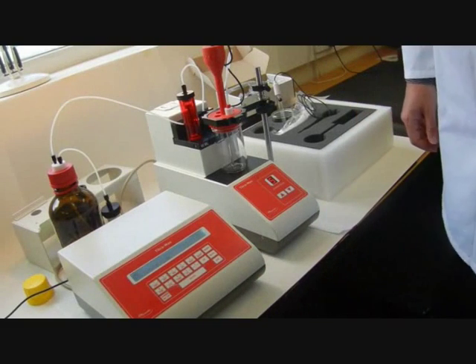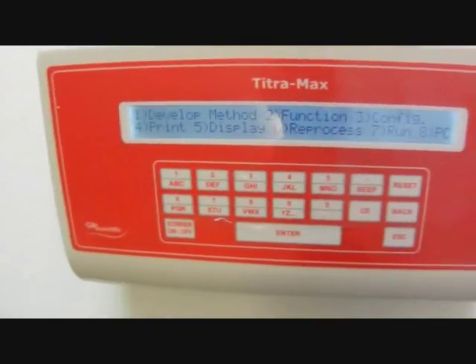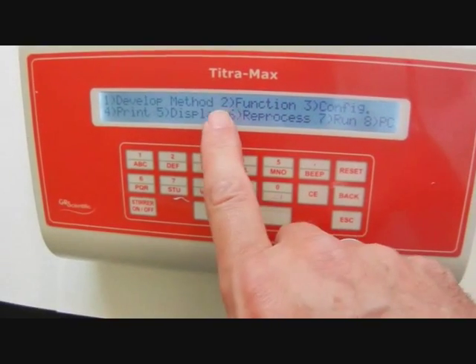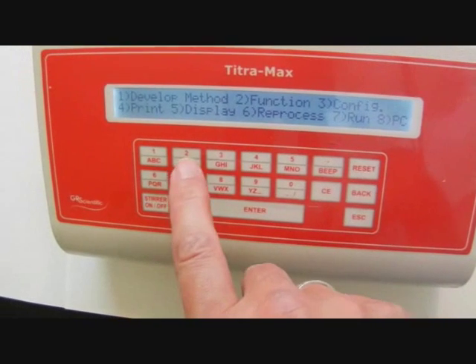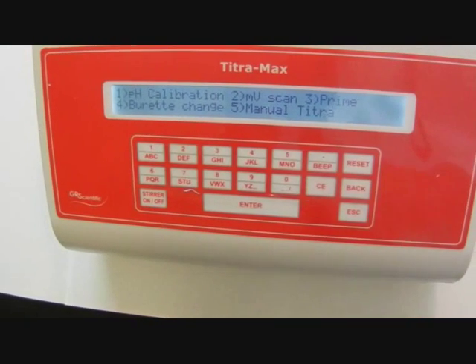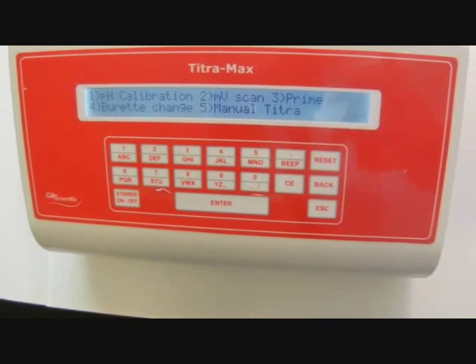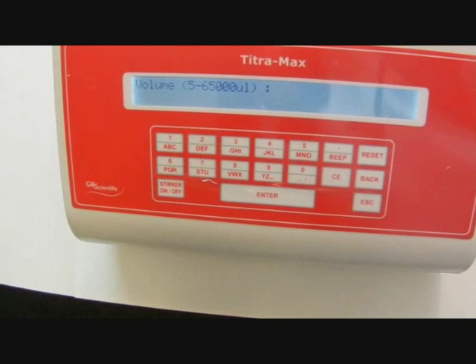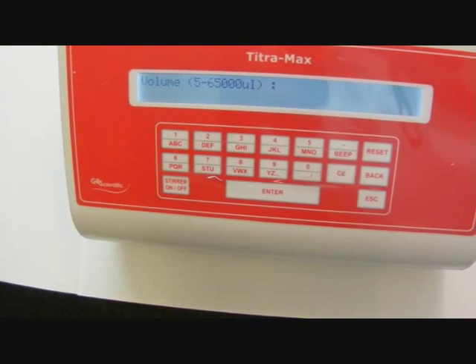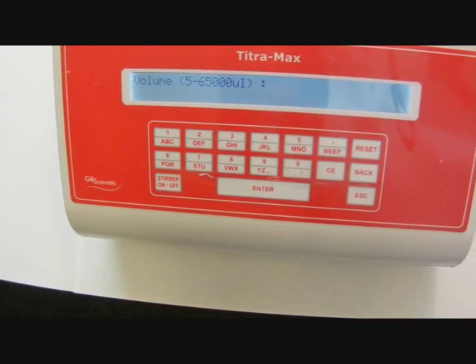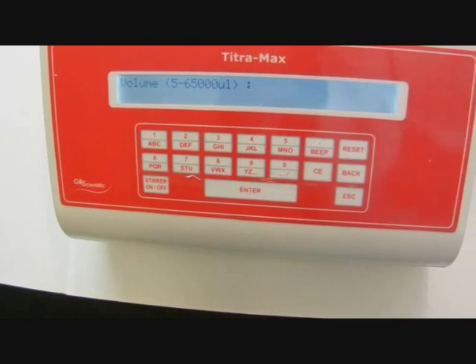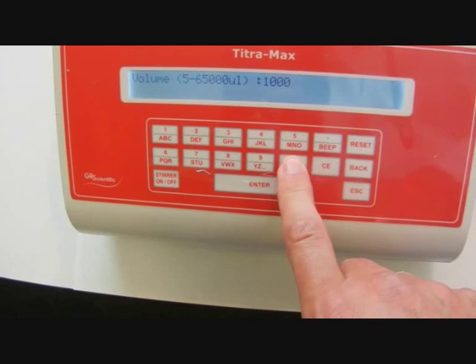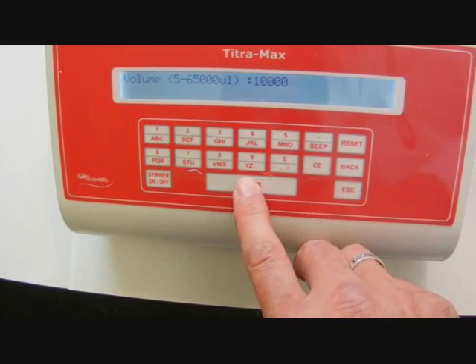We're going to turn on the unit now. This is the main menu. We need to select function which is number 2 and prime because we're going to prime the unit. Priming the unit ensures that the titrant fills all the tube and the burette leaving no air bubbles. To start with we'll select 10,000 microliters which is 10ml which is the size of the full burette.